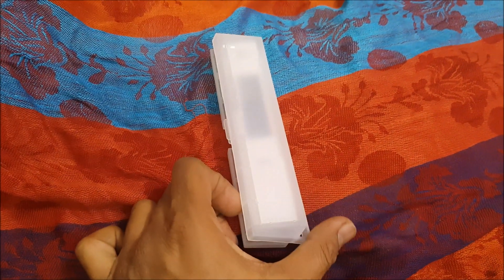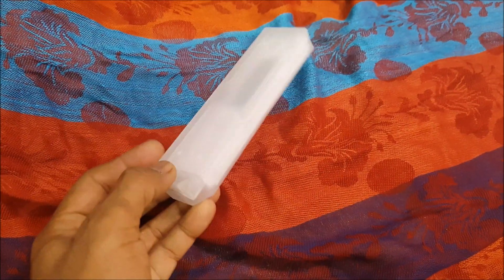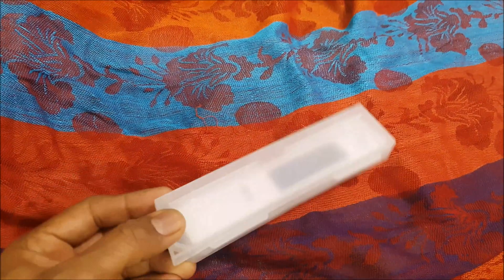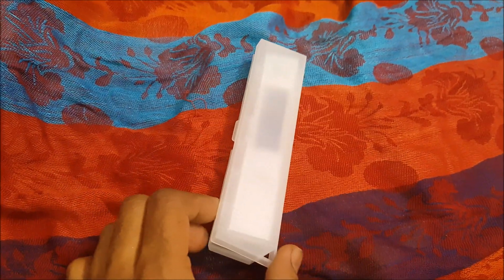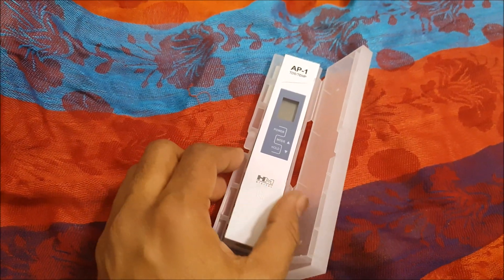I ordered this from Amazon. It came in good packing — though the box packing was not that great, the product itself comes in this plastic box, which is a good thing.